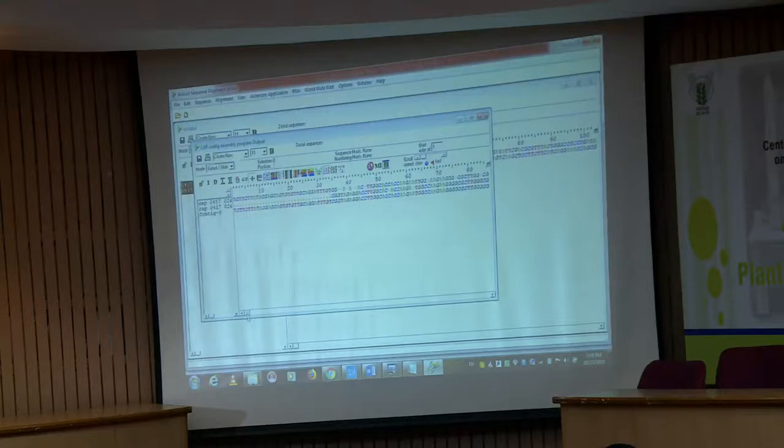If you scroll towards the left, you can see there is a region that only forward has, and a region that only reverse has, and can you see this extra region, because the central region will be overlapping in both sequences.